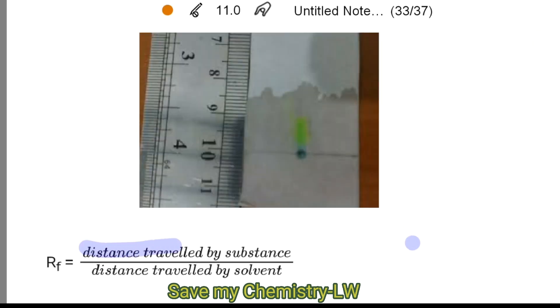Let's see this example, how to count the RF. We measure the distance traveled by substance using the ruler. Okay, see the sign, the green one. And then we measure the length of the spot using ruler. That is one centimeter.